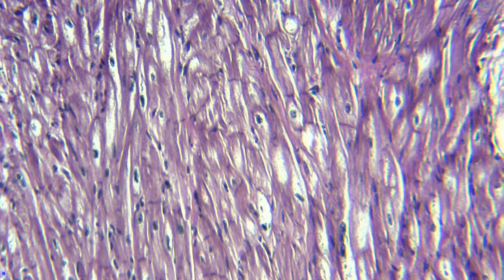A lot of people confuse this particular cardiac muscle slide with fibrocartilage, and I think that is because if you look at the nuclei, they kind of look like they're hovering outside of the muscle fiber. I honestly don't know why that is — I wish I could explain it, but I can't. But that is something I have seen in a lot of cardiac muscle slides, not just this one.